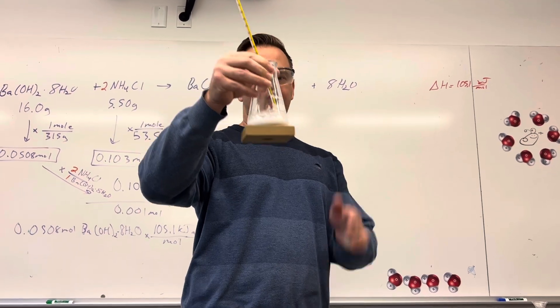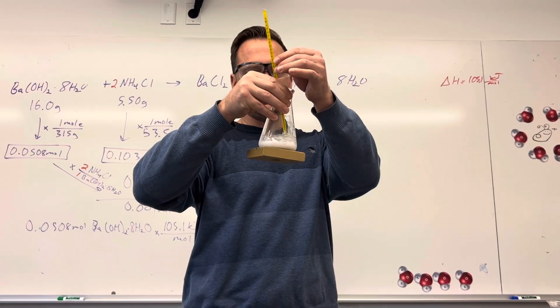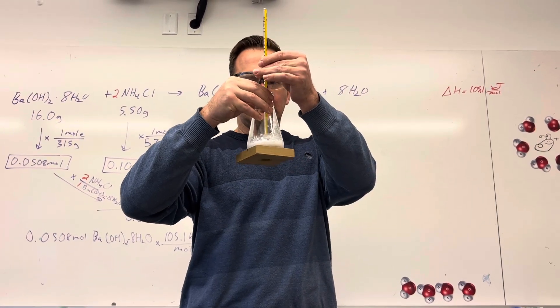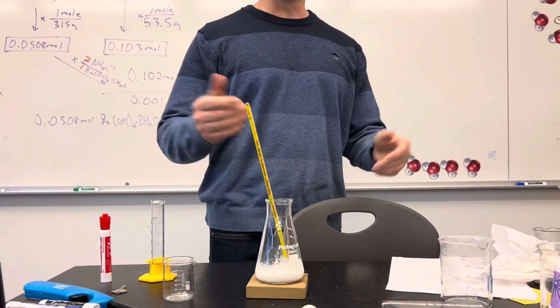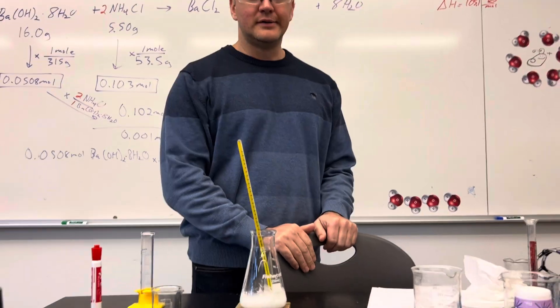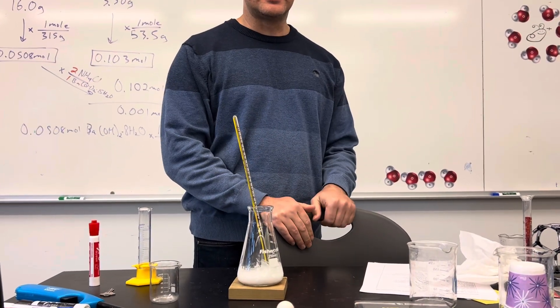So it's stuck and if you feel it, it's really cold. If you actually measure the temp, it is negative five degrees Celsius in here, below freezing, and that's why the Erlenmeyer flask stuck to the wooden block.